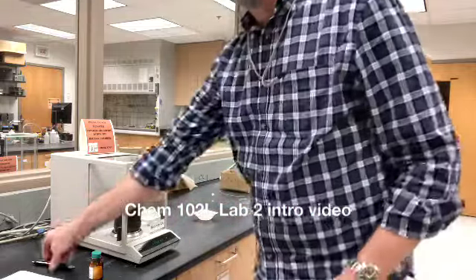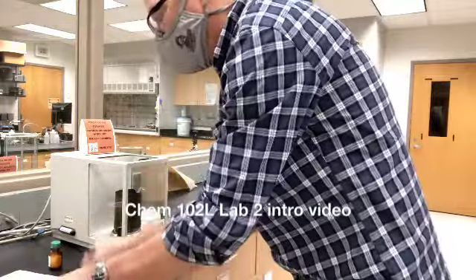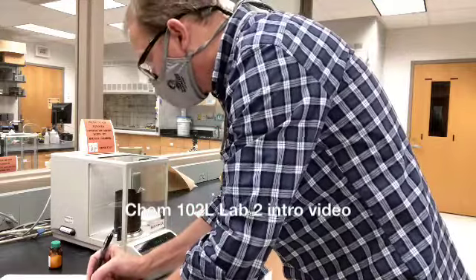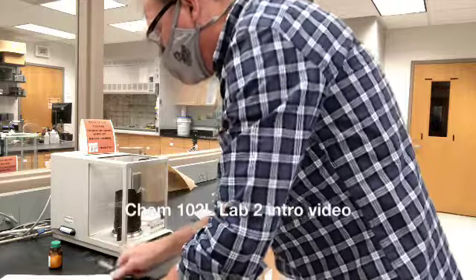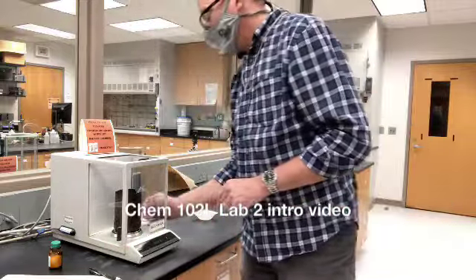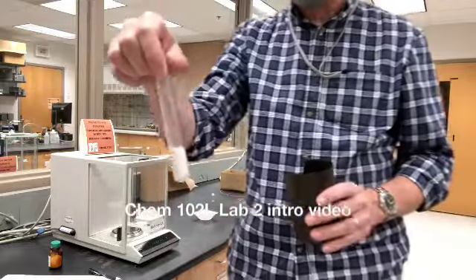And so now I can write down the mass. We'll have a report sheet that you can write this down on, and I'm going to write 3.9335 grams. So I've now measured that mass to 5 significant digits, and I have a very precise measurement of how much is in this test tube.